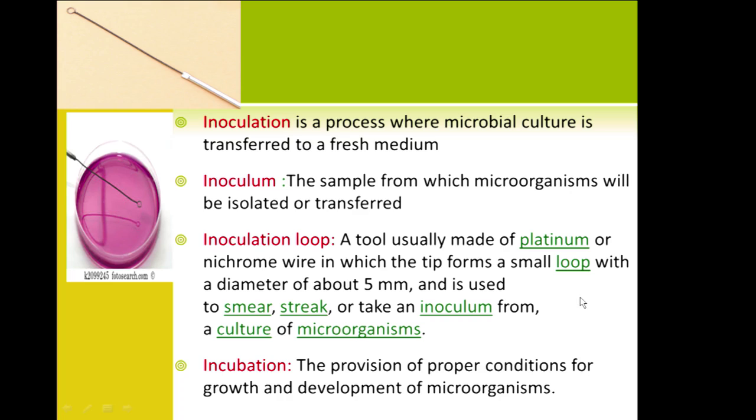Once inoculation is done on fresh medium, the medium should be incubated. Here incubation means we are providing proper conditions for growth and development of organisms. So, all the physical parameters at which you are incubating come under incubation conditions.